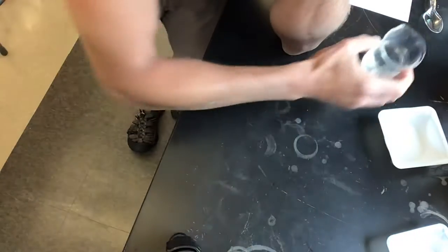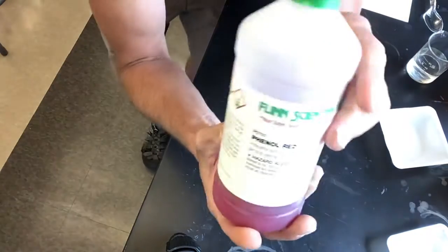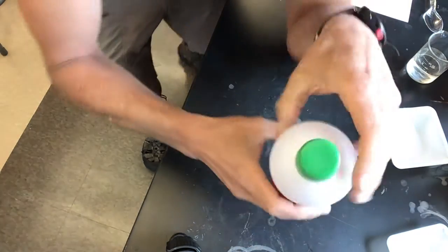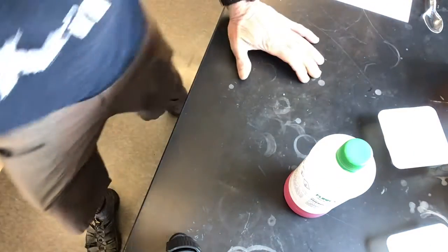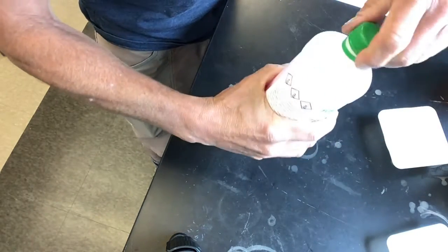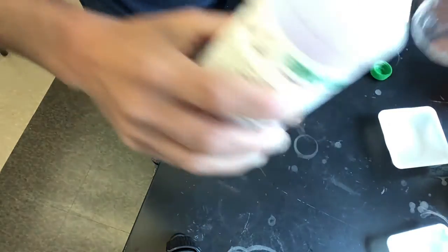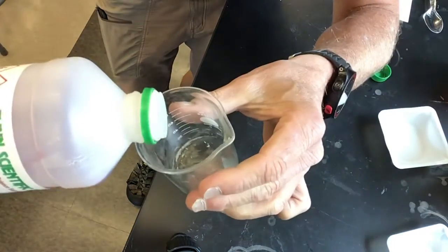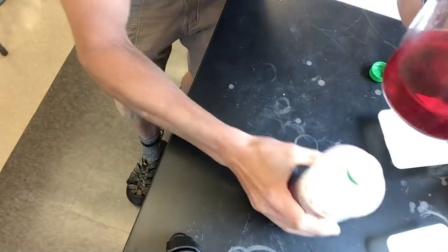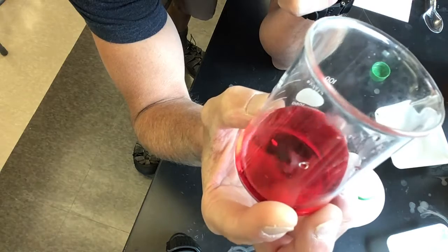And finally, the indicator solution. The indicator solution we're using is phenol red. I'm going to add phenol red to the beaker. So here's a beaker. There it is, and it's red in color.